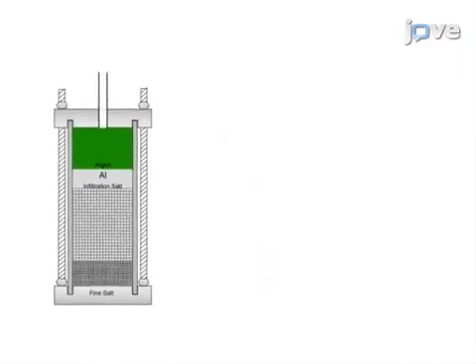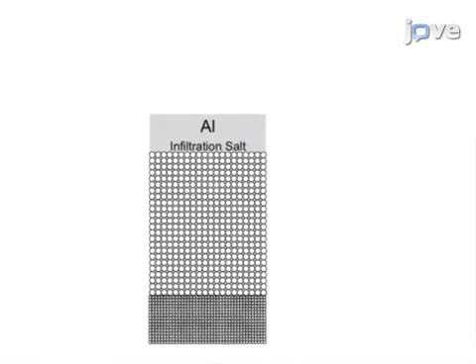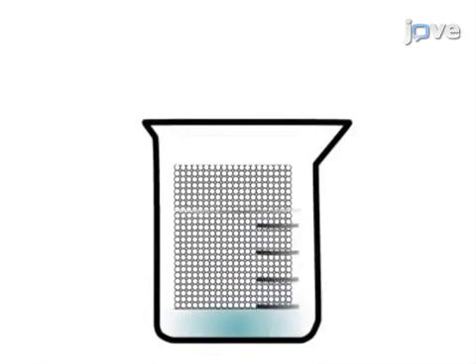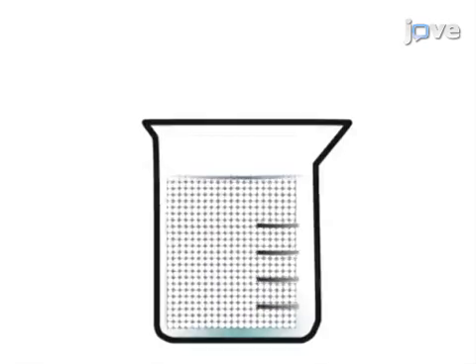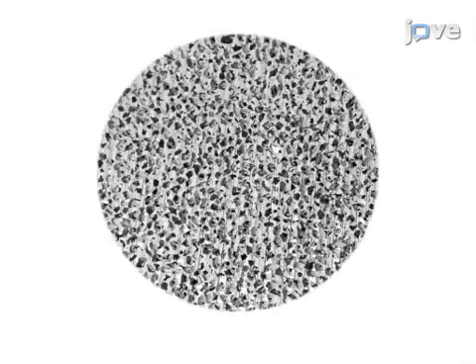The final steps are to remove the mold from the furnace and retrieve the foam sample, then cut the sample to size and remove the sodium chloride in a water bath. Ultimately, the weight and volume of the sample will indicate its density and inform modifications in the protocol to obtain foams of different characteristics.